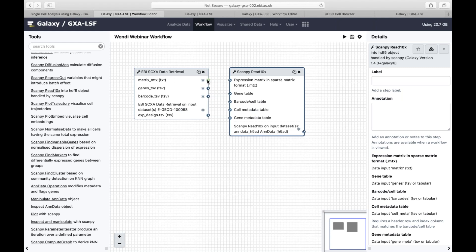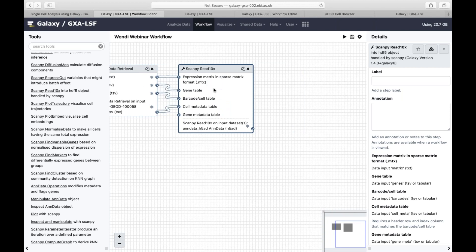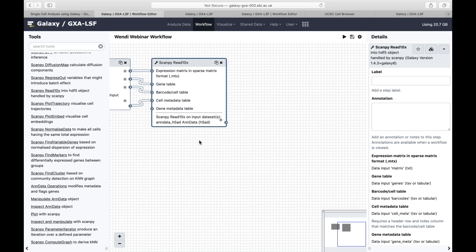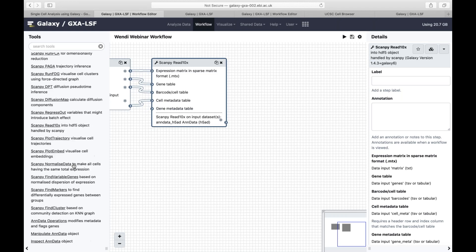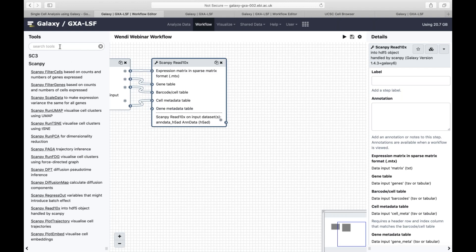Now we get to how Galaxy works at its core. We have our matrix over here and we need to link it to the next tool. What's brilliant about this is that if the arrow is green, you can link it and it's formatted correctly. So: genes to my genes table, barcodes to my barcode table, and then all the cell metadata — disease, sex, individual — I can link across. The input is at the top, the output at the bottom, and this is making my scAMPi object that I can then run different analyses on.